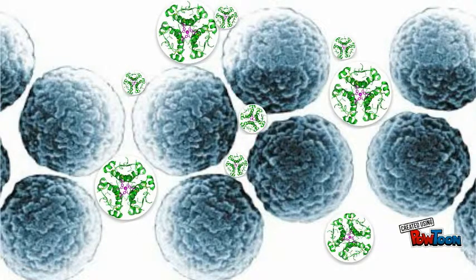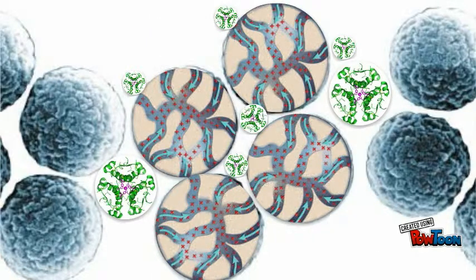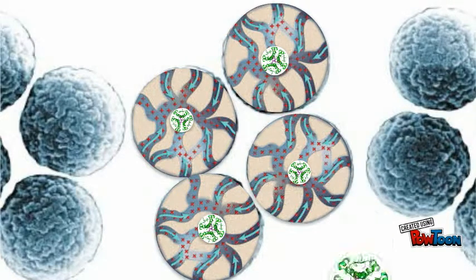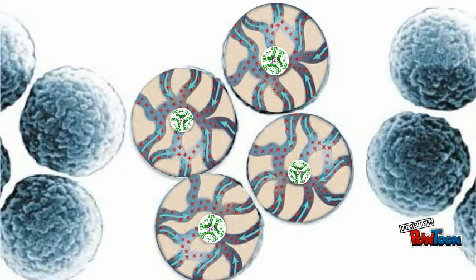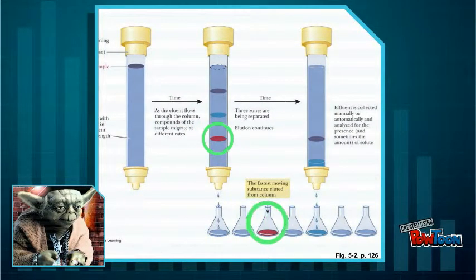In gel filtration, these beads have small channels meandering through them. Larger molecules pass around the beads, while smaller molecules travel through them. Through this process, larger molecules exit the gel first, while smaller molecules travel through the network of tunnels, lengthening their transition through the column. Each filtered solution is collected in stages, or fractions. Each fraction contains progressively smaller molecules.